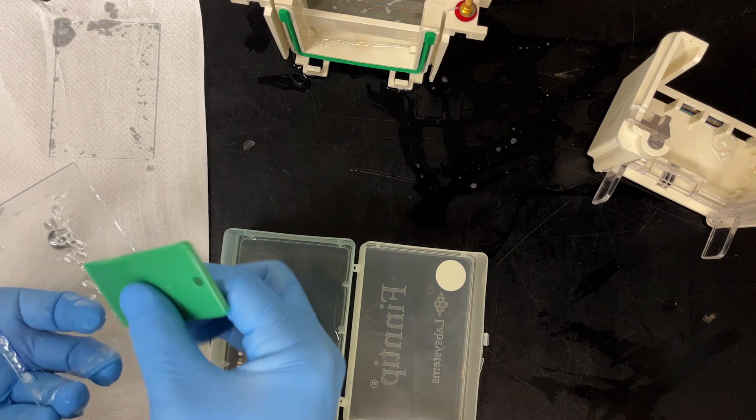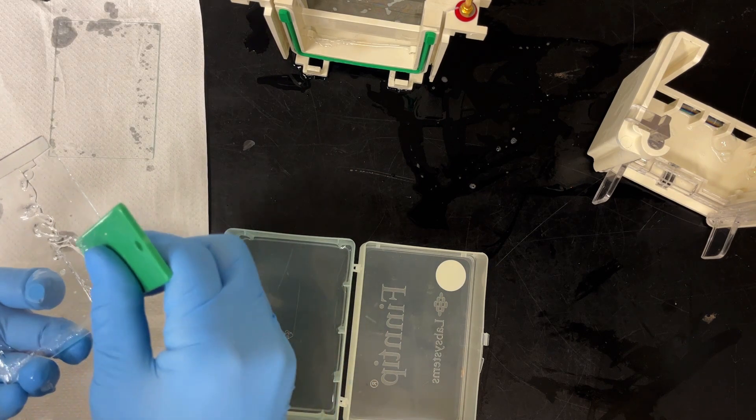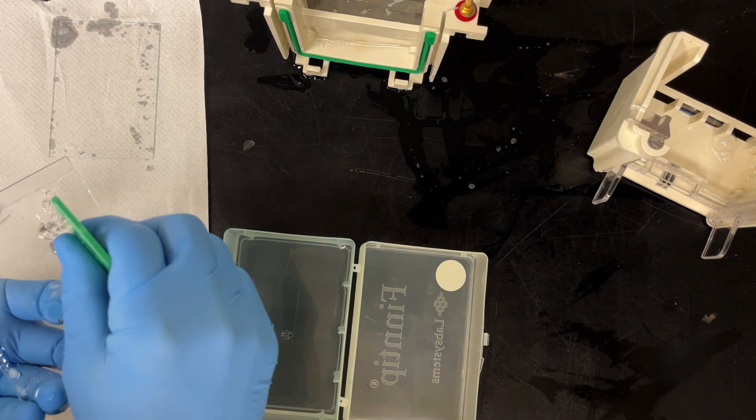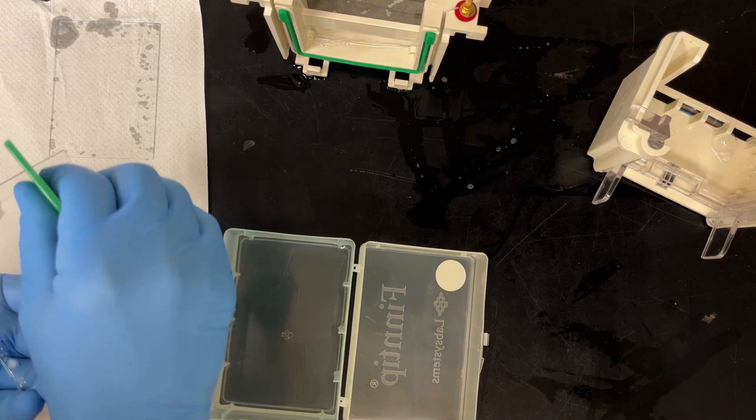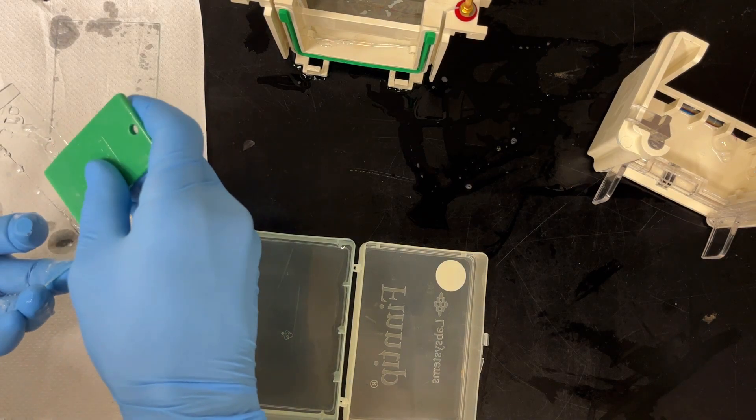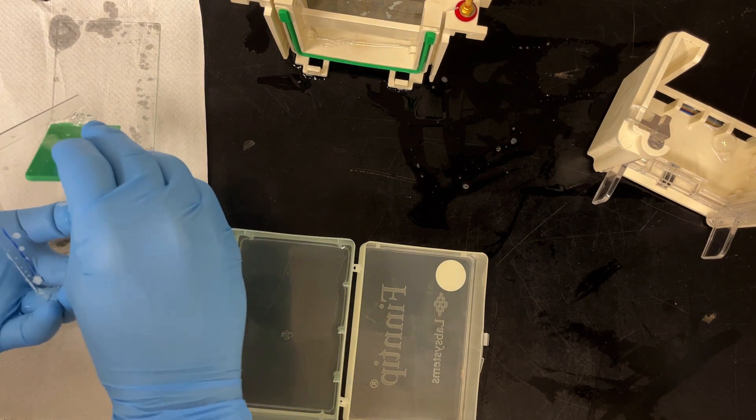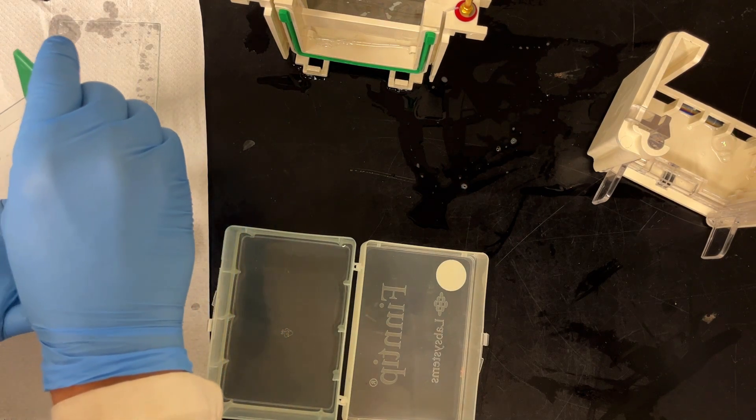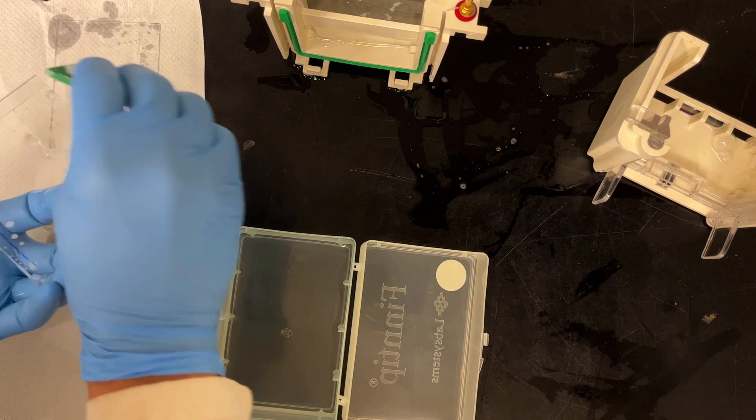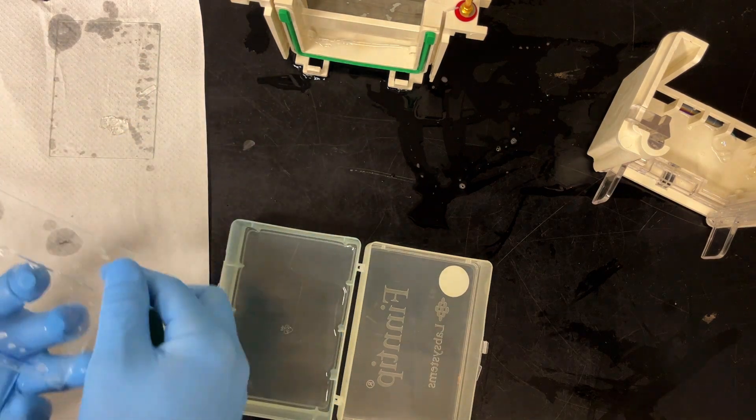And then I'm just going to peel, let the gel stick to the glass plate it wants to. In this case, it's the big plate. So once again, lane one is on the bottom there, or if I were looking at it on the right. Peel off the combs, the wells.